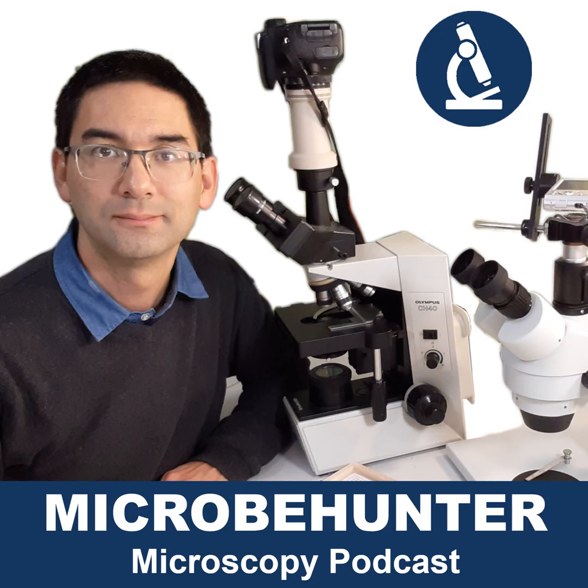And there is a physical law which was proposed by Ernst Abbe back in, I think, the 19th century. This gentleman worked at the Zeiss company, and this is one of the most fundamental laws of microscopy, which basically says that there is a certain limit to what a light microscope is able to resolve. And this depends also on the wavelength of the light and also on the so-called numerical aperture, which is a property of the objective. I do not want to go into the math now. But there is a limit, and if you want to still see those details, then you have to use a different type of microscope, for example, electron microscopes.